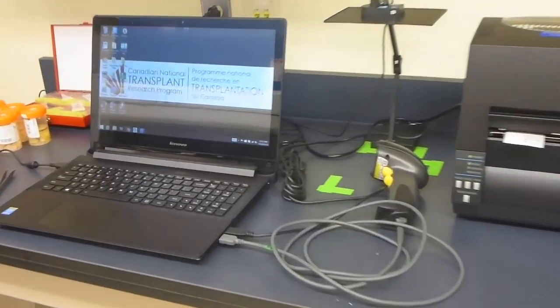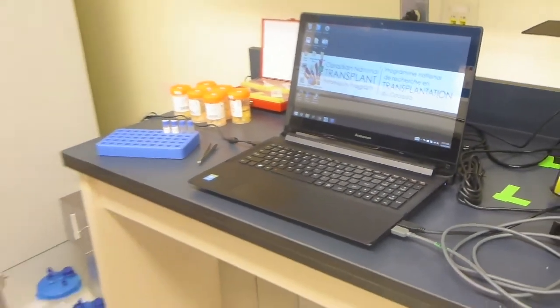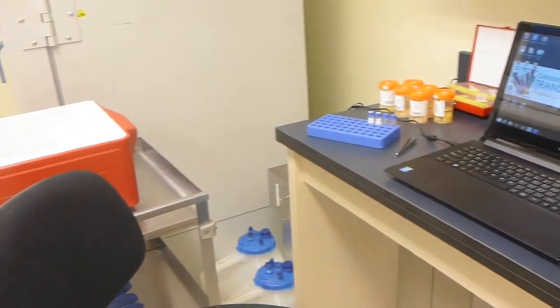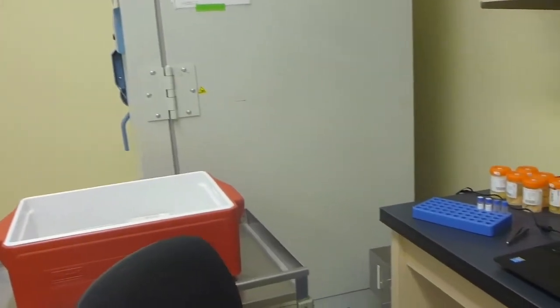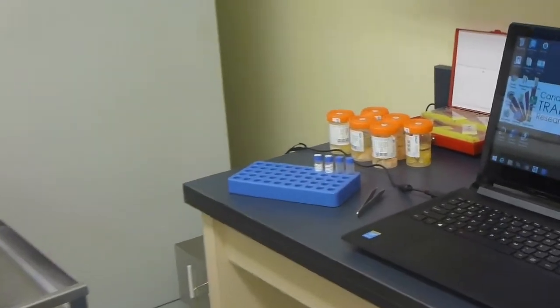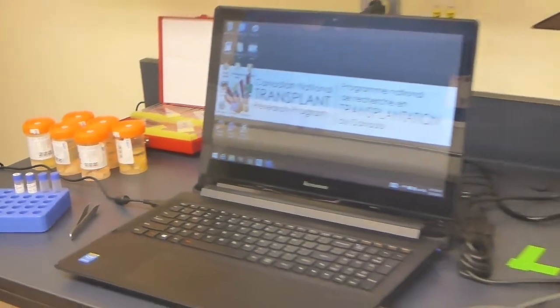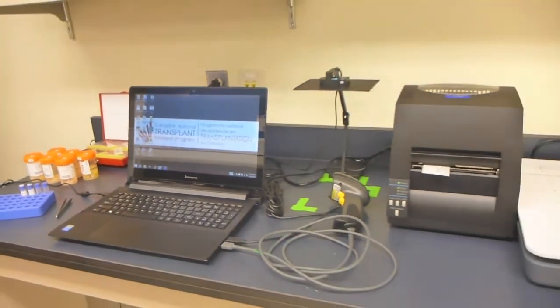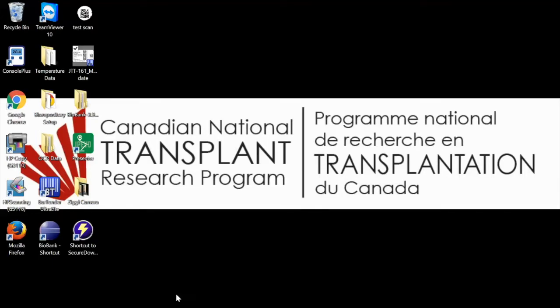Prior to receiving our biorepository in a box, as you can see here, we used Excel spreadsheets to keep track of inventory, sample location, and distribution. This primitive method of organization actually made it difficult to streamline cell and tissue processing for biobanking. Aliquots weren't getting entered quickly enough, and data wasn't being updated with the number of samples remaining after distribution. An alternative method needed to be devised.